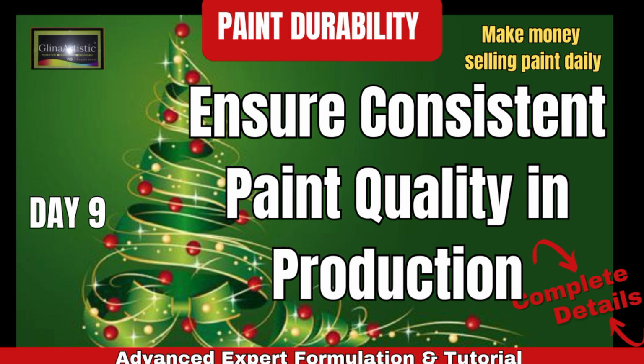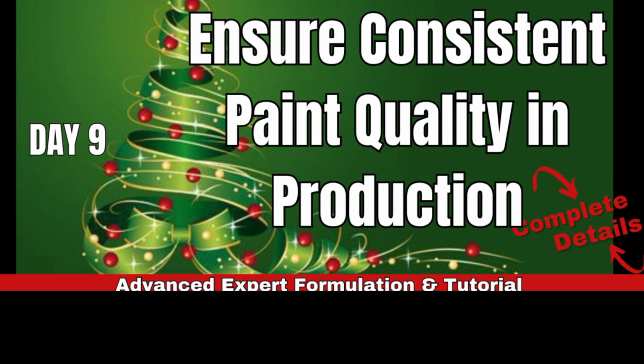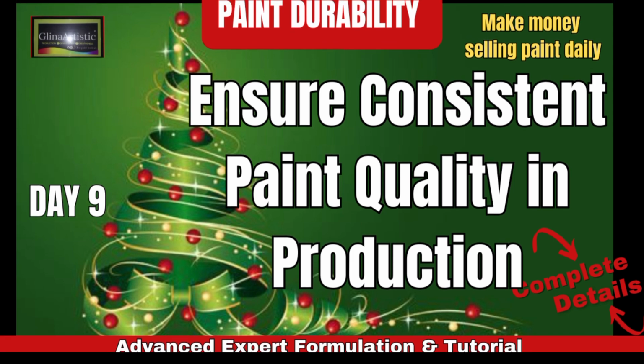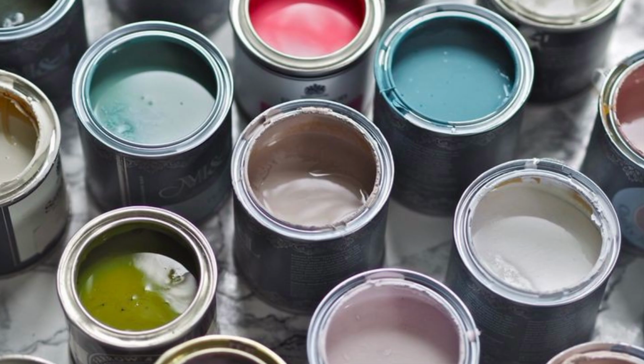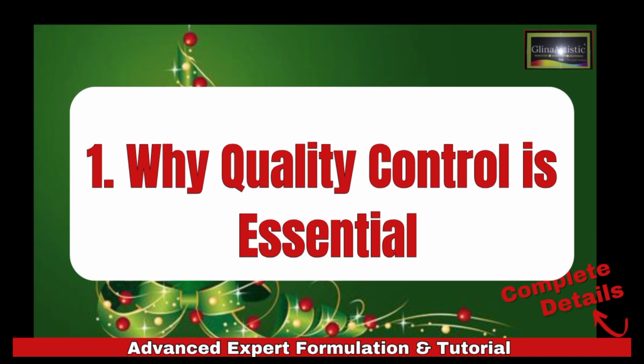So, we are focusing on one of the most critical aspects of paint production. Yes, how to test and ensure consistent paint quality. Whether you're just starting out or scaling up, these techniques will help you produce paints that are durable, reliable, and market ready. So now, consistent quality is the backbone of any successful paint business.